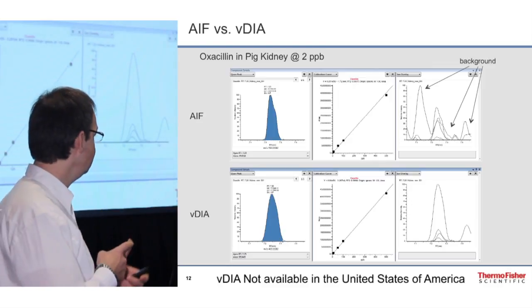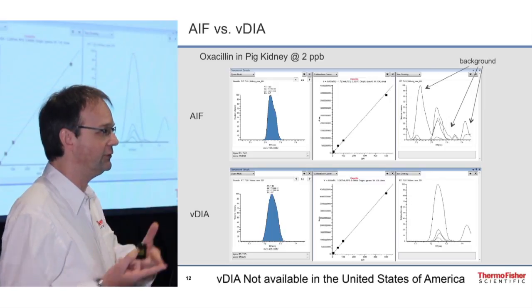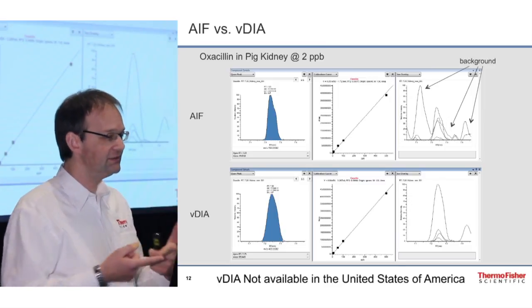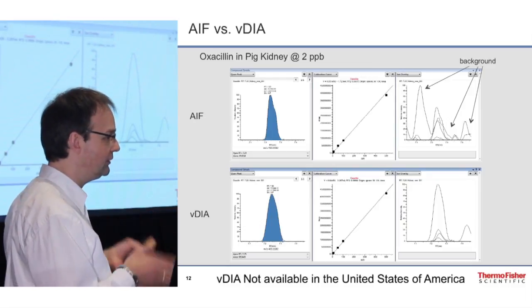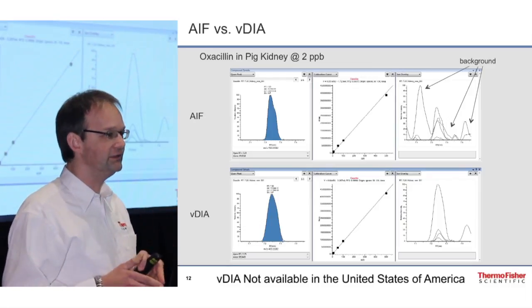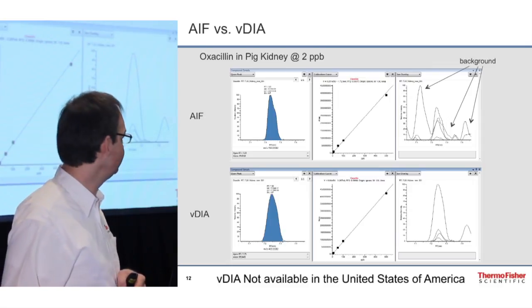By this, selectivity is higher, and by this, the sensitivity is enhanced because you can confirm to lower limits. And as it comes out in the end, if we do a comparison on the same instrument, it compares very well with full-scan data-dependent detection. So the limits of detection are basically the same on both modes.